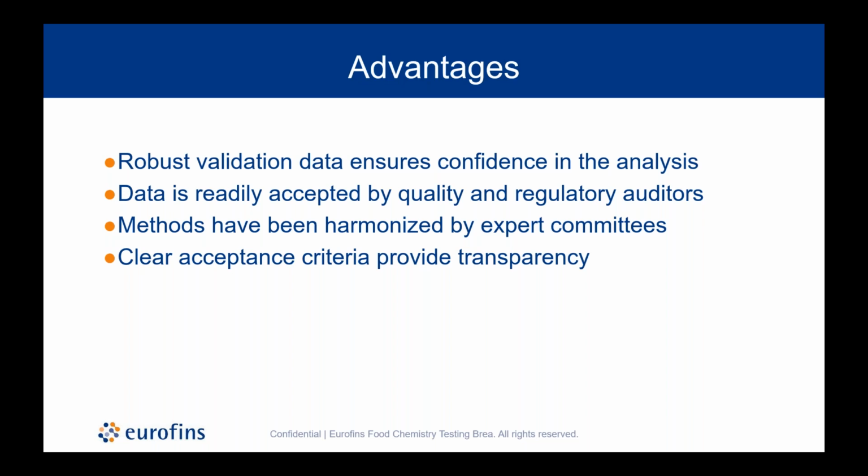And that information is again provided on the C of A. So when you have the C of A in your hand, there may be questions, but there's a lot of information there to help in the conversation of answering the questions about why is my result a pass or why is it a fail.